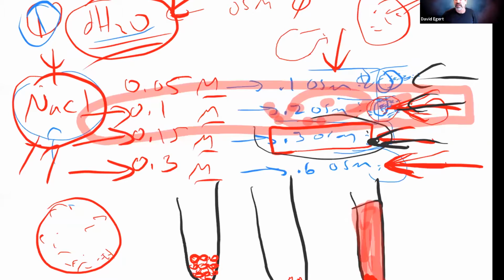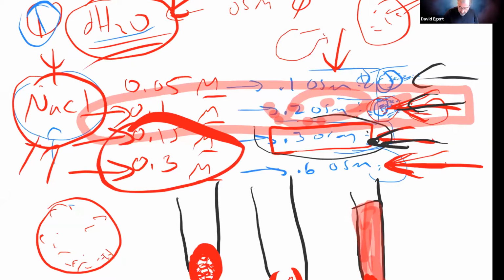pure hemolysis, everything explodes. It's just going to be red supernatant, no pellet. Pure no hemolysis, I'll just have a pellet and a clear supernatant. But there's also partial hemolysis. Some of them explode, so I get some hemoglobin up into the water, but some of the cells stay intact and get pulled to the bottom when I'm doing the centrifuge. So that all makes sense.